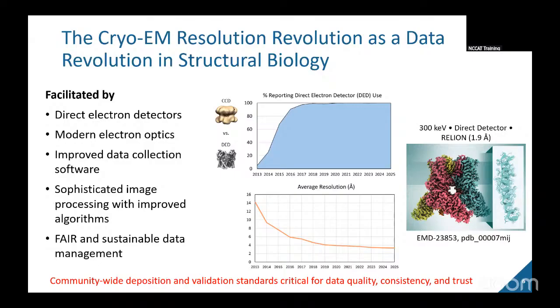One of the things that I do want to point out is the critical importance of FAIR and sustainable data management. FAIR meaning that data is findable, accessible, interoperable, and reusable.